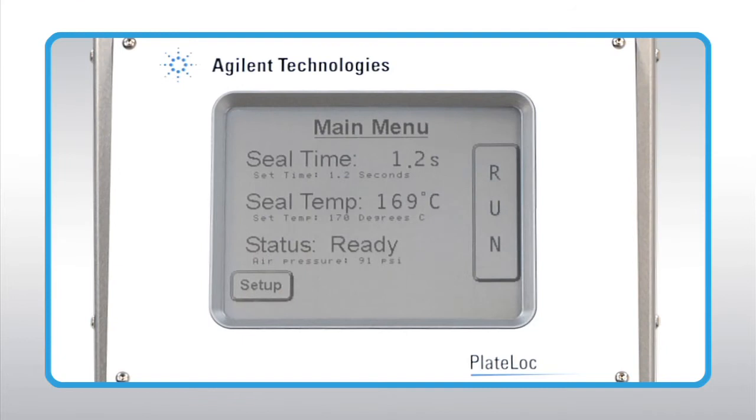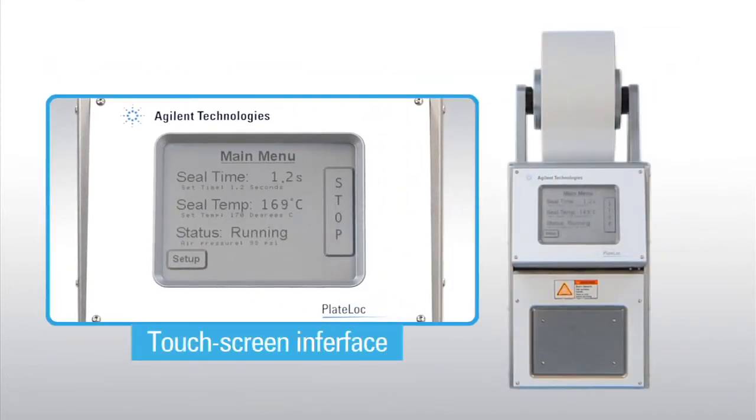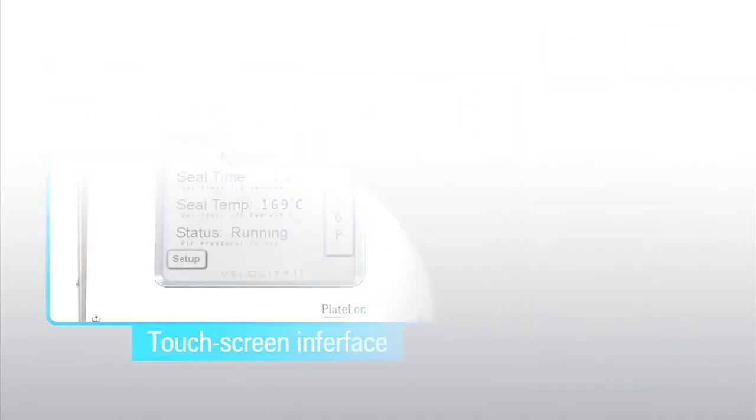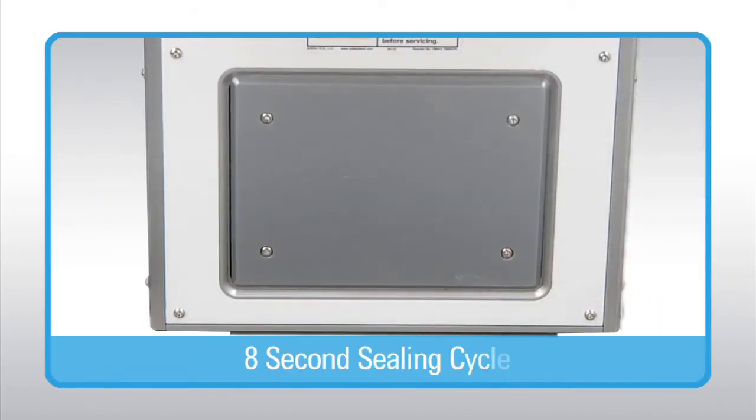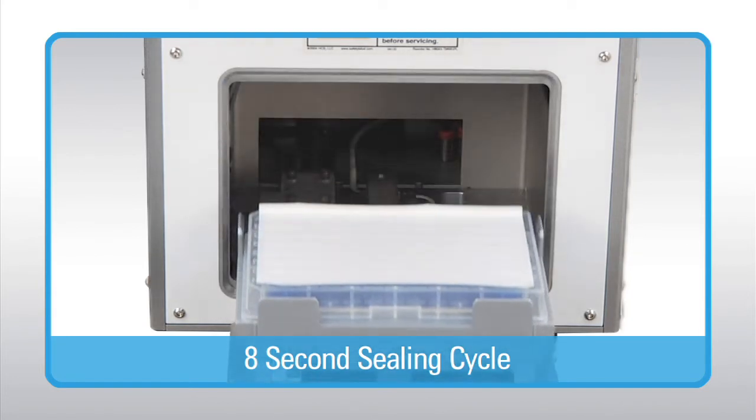A large, easy-to-read touchscreen interface allows for fast and easy manual operation. The PlateLock is ready to quickly respond to plate sealing chores since no cool-down periods are required. The typical sealing cycle is 8 seconds.